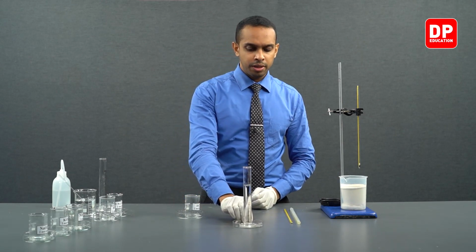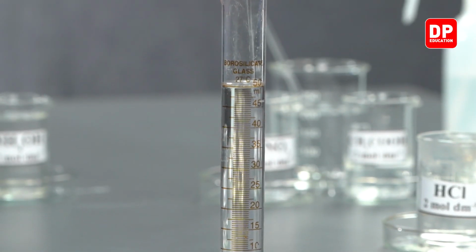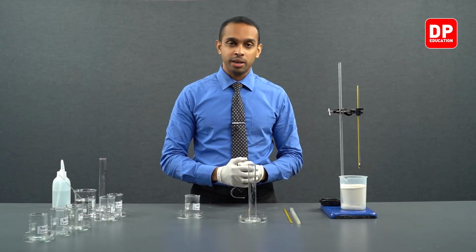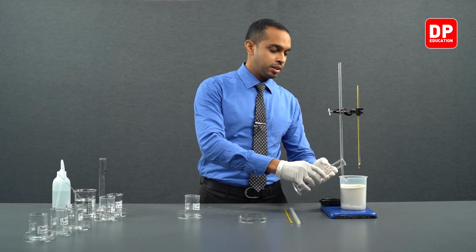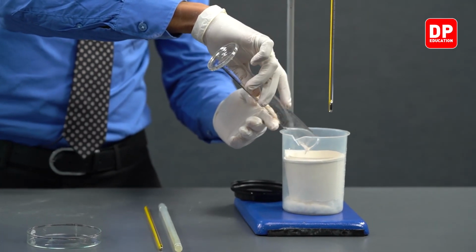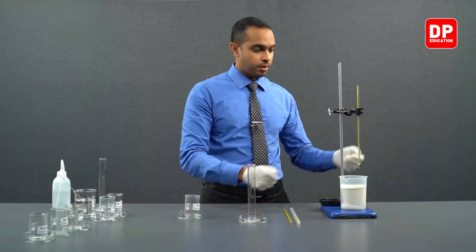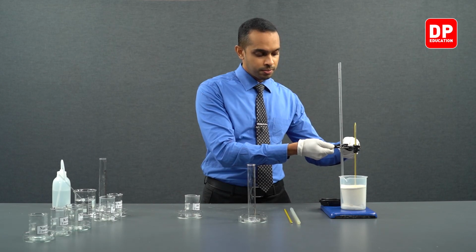We have taken 50 milliliters of hydrochloric acid, and we are going to add this hydrochloric acid into our plastic container here. And let's measure the temperature.